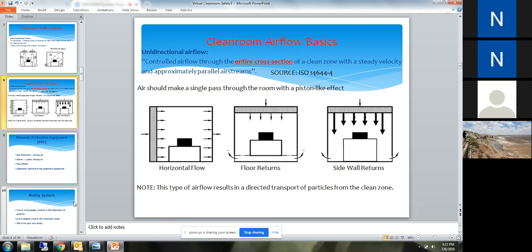So your chillers, your gas cylinders, your gas cabinets, anything. Most gas cylinders that I've seen are rusted and therefore detrimental to the clean room processes, and therefore they put those in the chase. And in the chase is where the return air is.